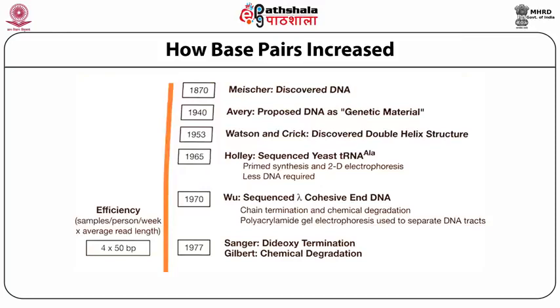of DNA sequencing. With the advent of the Dideoxy chain termination method, it overtook all other methods because it was easy to perform and it avoided the risk of radioisotopes.